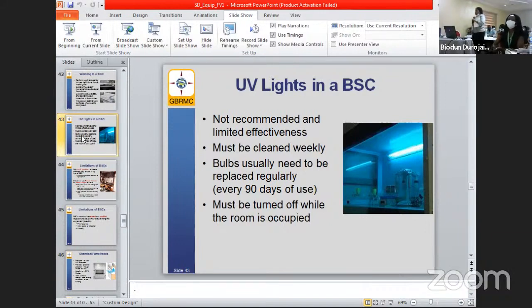Yes, so it's recommended that when you put it on, there's a number of minutes it will stay. How many minutes now? 30 minutes? 1 hour? It will all depend. Then you switch it off.